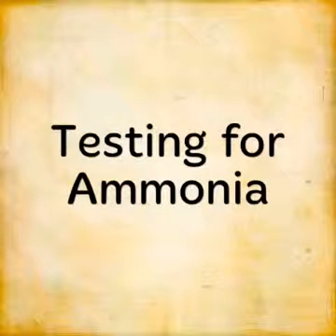This video is going to show us how to test for ammonia and how to test for ammonium ions. First of all, we are going to start off with some concentrated ammonia solution. When you take the top off this, it starts to produce ammonia gas, which we can't see, but we should be able to test for.